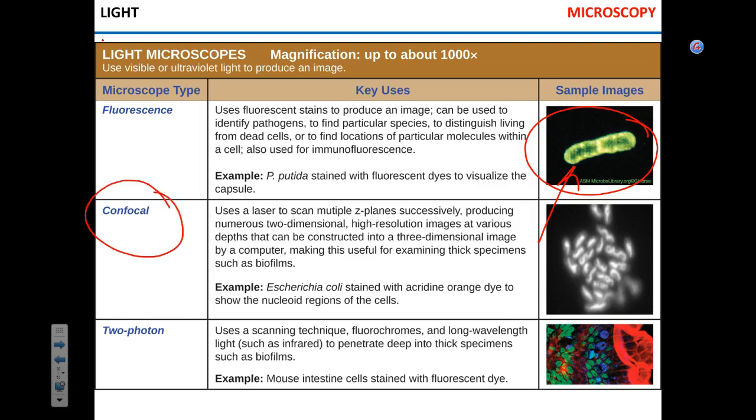Now, confocal microscope is kind of a Mercedes-Benz of light microscopes. This is one of the most terrible images of confocal microscopy that I've seen in my life. But I guess this is taken from that free online textbook that I told you. Perhaps that's the one that they got their hands on for free.